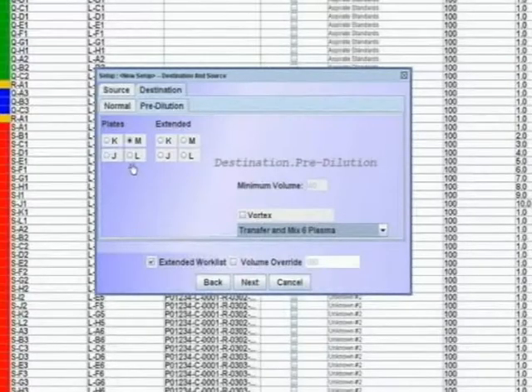The formatter has 4 microplate locations, J, K, L, and M. For an extended run such as this example, 2 of these plate locations are used as destinations. That leaves 1 microplate for pre-dilution and 1 microplate location that may be used for incoming samples such as the standard and QC samples. The standard and QC samples may come into the program from 1 ml tubes in the 96 well format or from cryo vials in the S rack. The choice of which location to be used is at the operator's discretion.